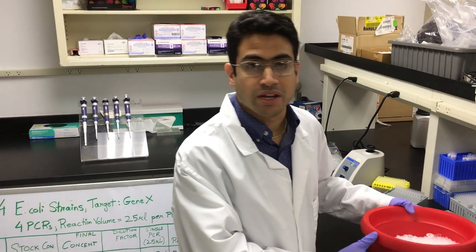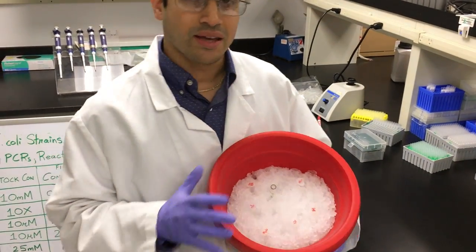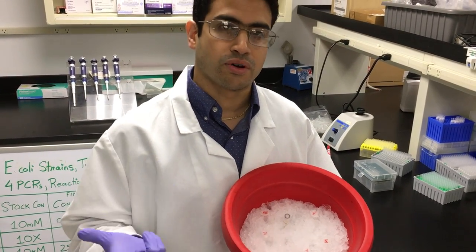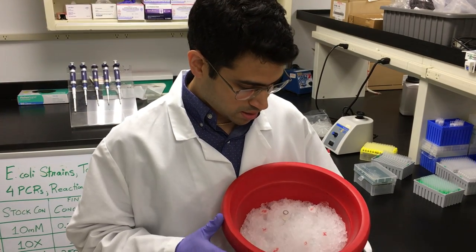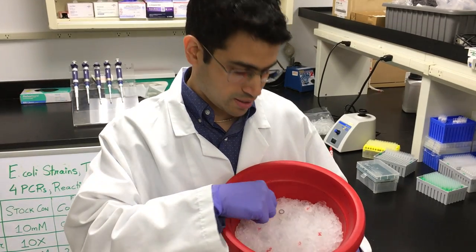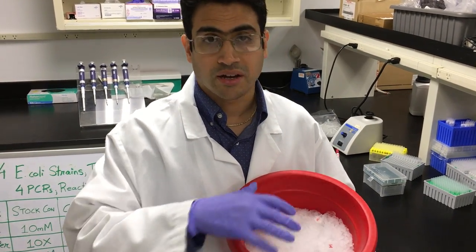The first thing to be ready with is an ice bucket, which I'm showing you over here. I've pulled out working stocks of each of the ingredients: the magnesium chloride, the forward and reverse primers, the dNTP mix, the PCR buffer 10X, and the Taq polymerase. I've pulled all these out from the freezer.